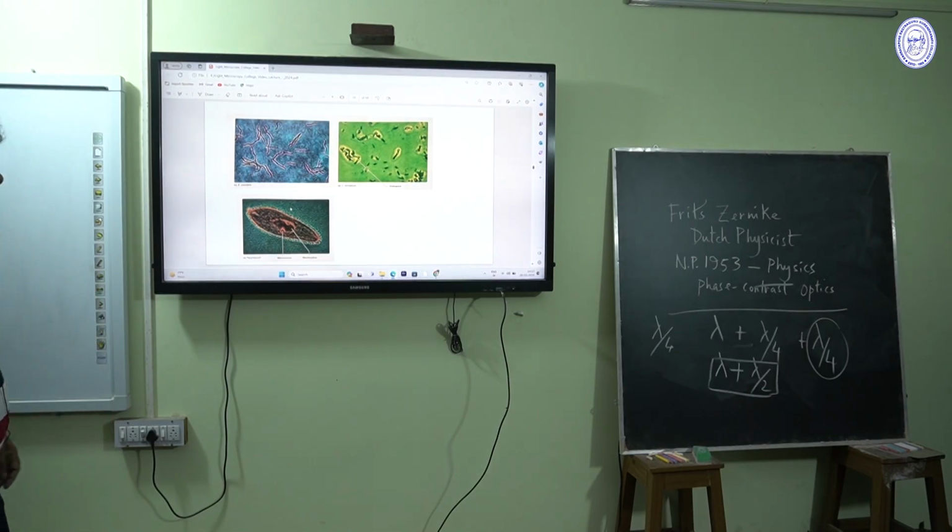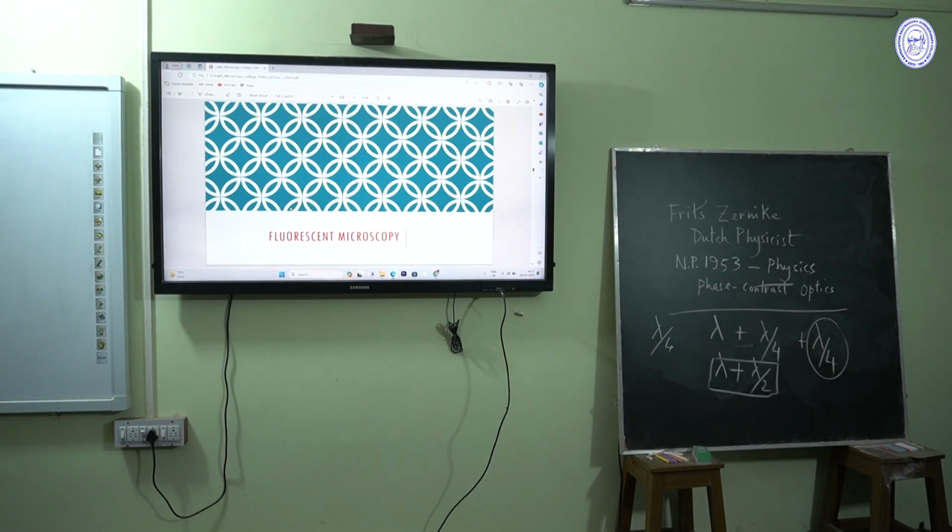These are some images. Now I am coming to fluorescent microscopy.